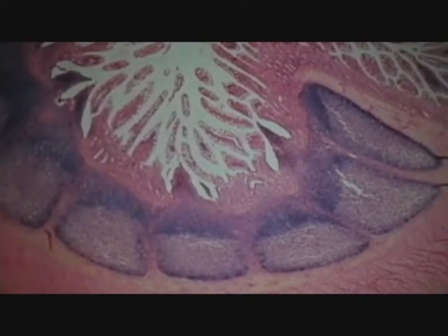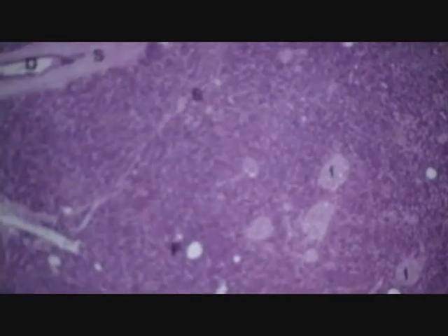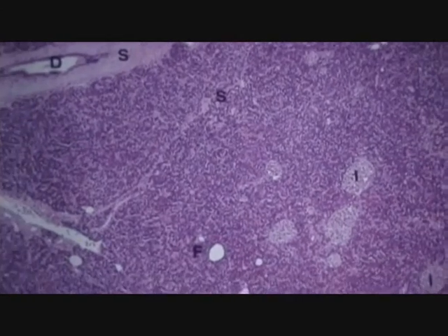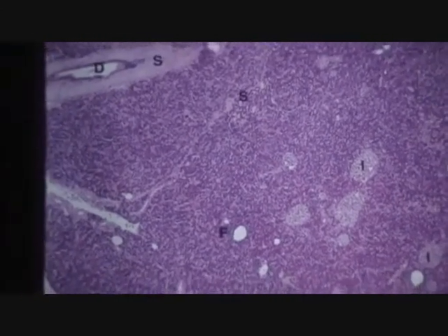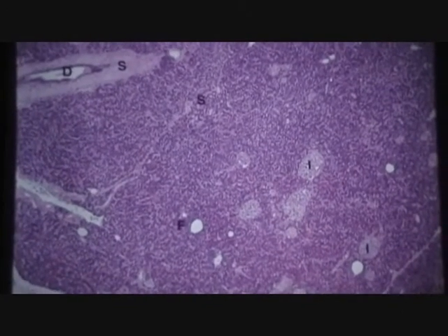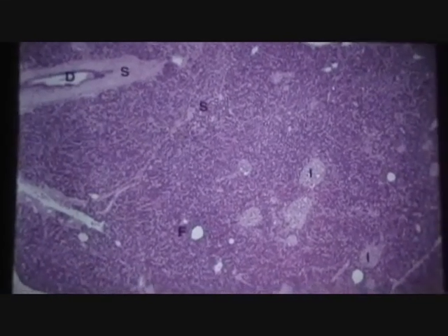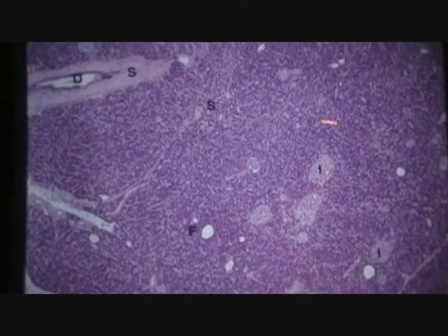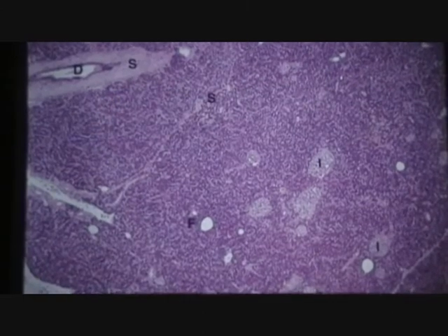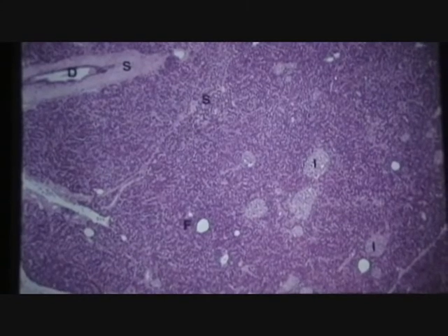All right, everybody getting confident? I have to bring you back to earth. Name this tissue. What GI-associated tissue would you call this? Yeah, looks like serous cells everywhere. Massive concentration of serous. Is it parotid?